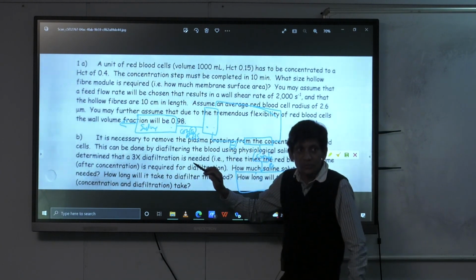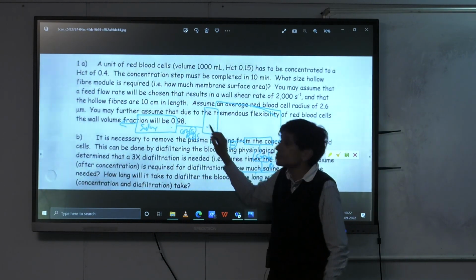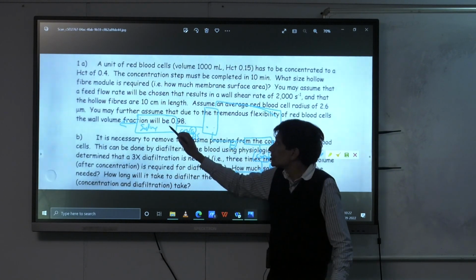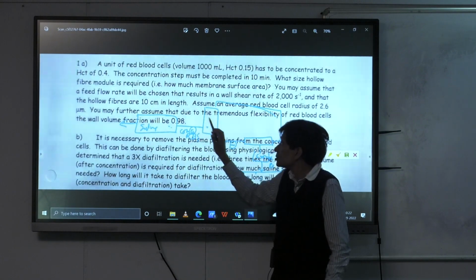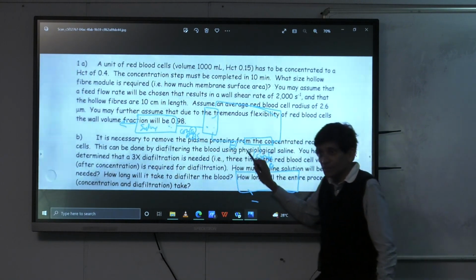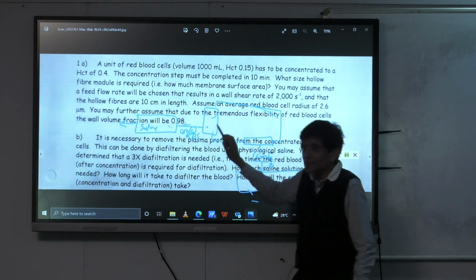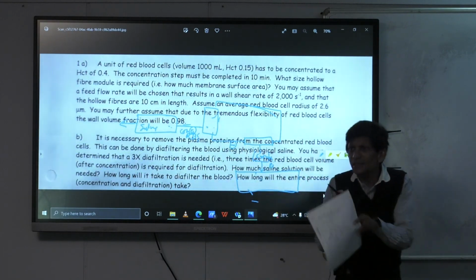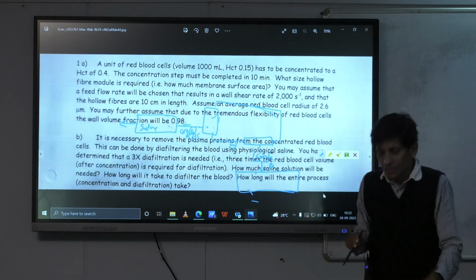So one way to do it is that if it's a blood bag, you'll have to pump. But if you had a rigid vessel, you could just attach this here, and because you create a partial vacuum as you're pumping out from here, this will automatically suck stuff in at the same rate. But a blood bag won't work because it'll collapse, okay? All right, so we got that.